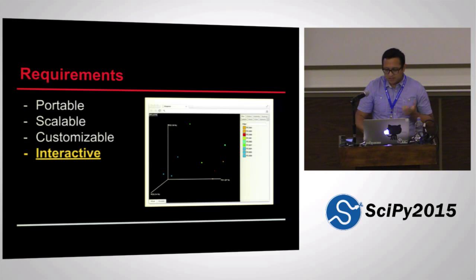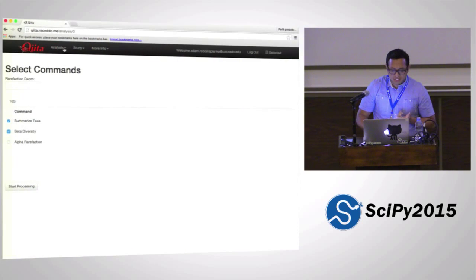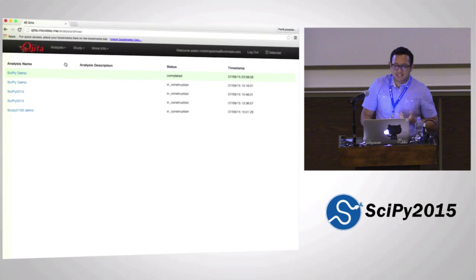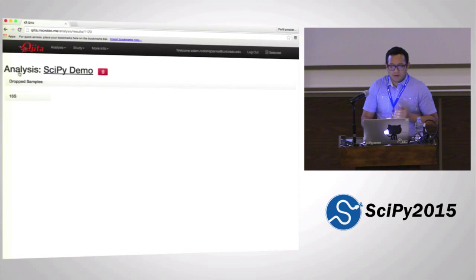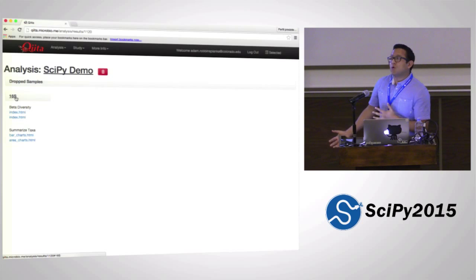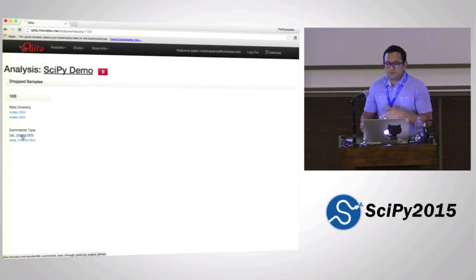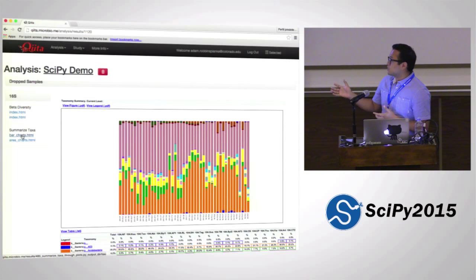And so I'm going to go back into Qiita, and I'm going to go to my list of previous analysis. This is the analysis that we ran last night and a few of the ones that we rehearsed on. What I'm presented with here is just the results that come out of Qiita. As Adam mentioned, one of them is going to be taxonomic summaries.